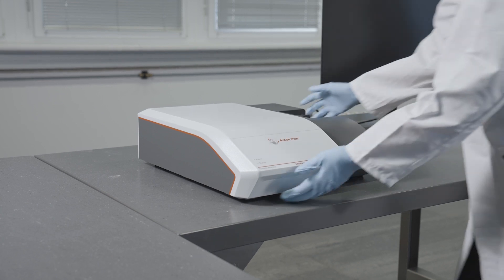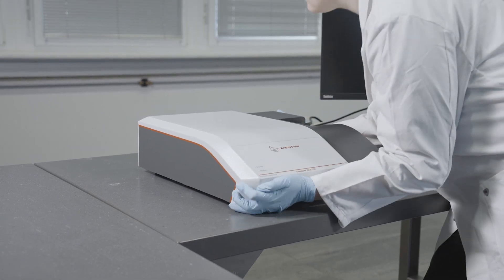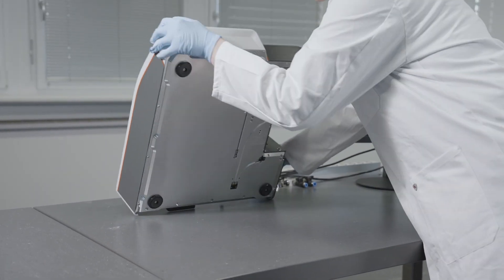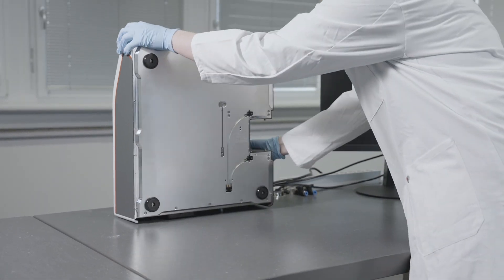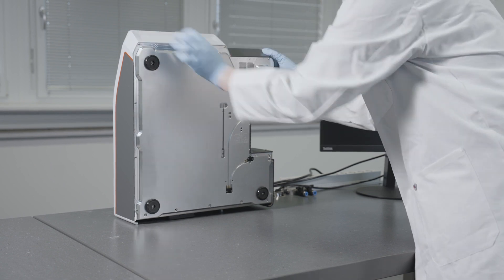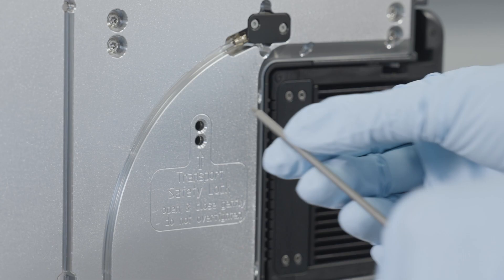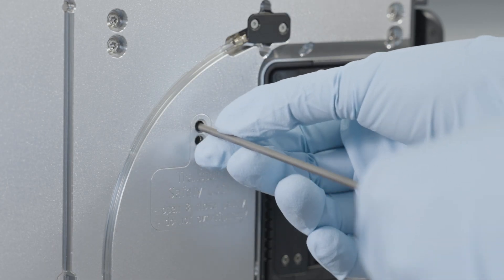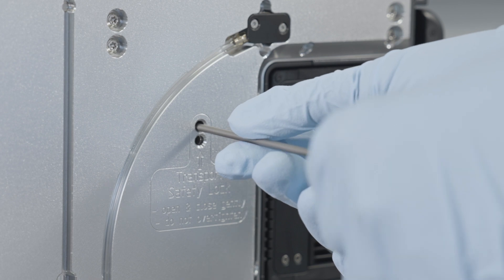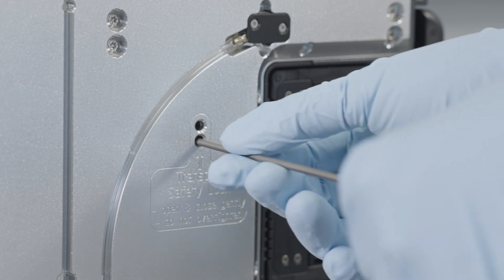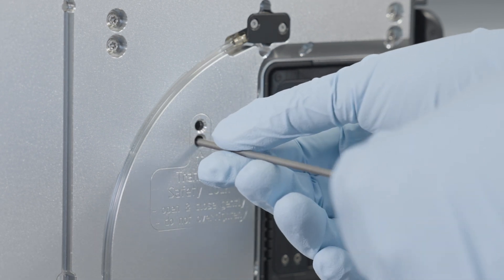For relocation and transport, the transport lock of the LightSizer DLS must be re-engaged. Use the provided tool to turn the screw clockwise until you feel resistance. Make sure to not over-tighten the lock.